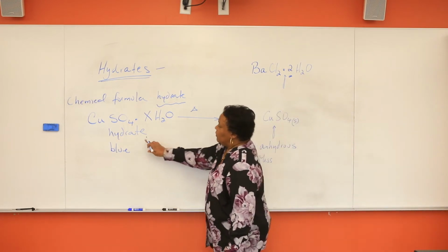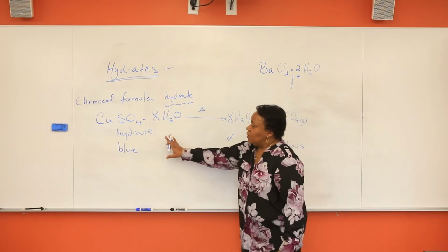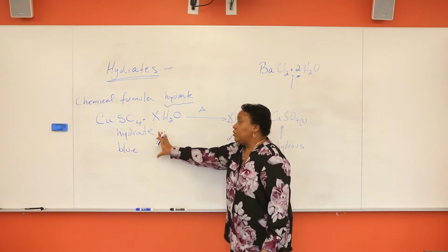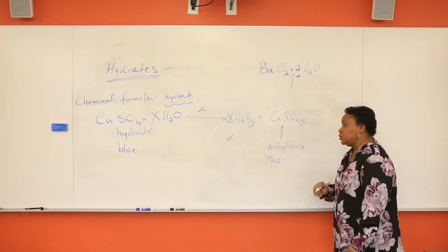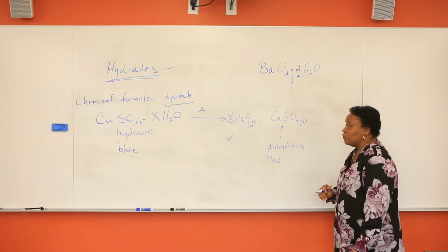Please note, several color changes will probably occur in this experiment. Most hydrates are usually colored, not all, but most are. And on heating, I assure you that you will observe a color change. So please note that as we proceed in this experiment.